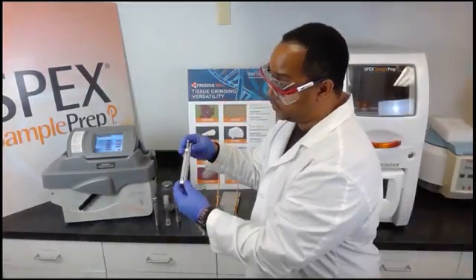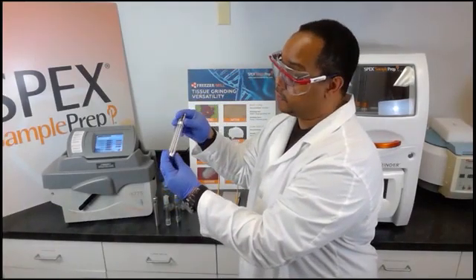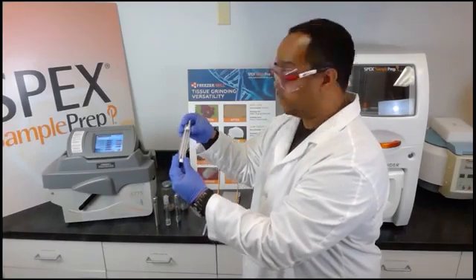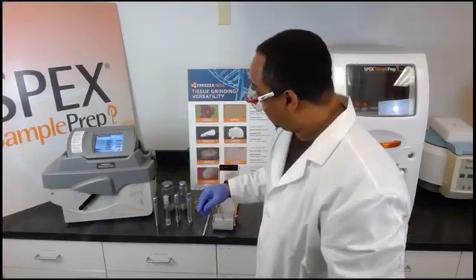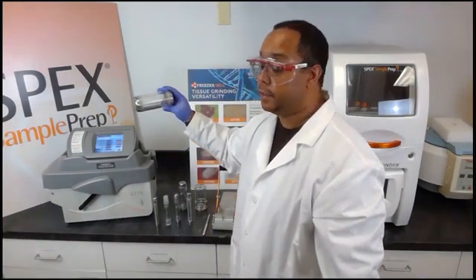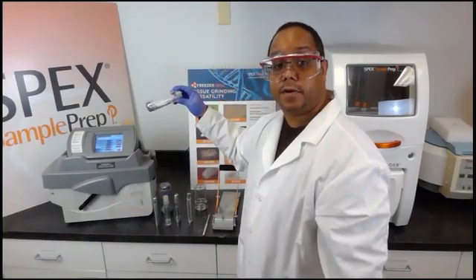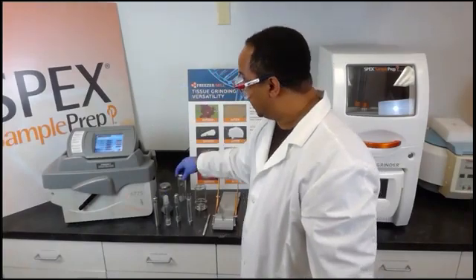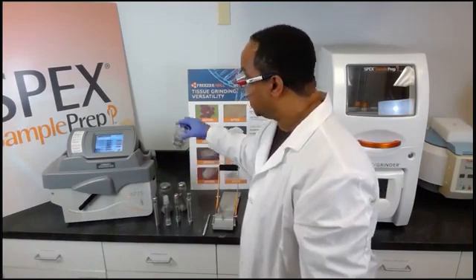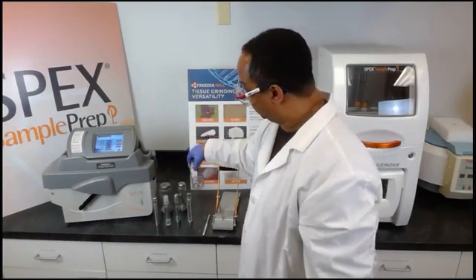Other vial types include micro vials, which are mainly used for biological samples or plant material, but in some cases can grind tougher samples. The large vial is used for the large freezer mill. We have a medium vial, which is also used for the large freezer mill. And the large freezer mill can actually run any of the smaller vials by using an adapter to fit inside the grinding chamber.